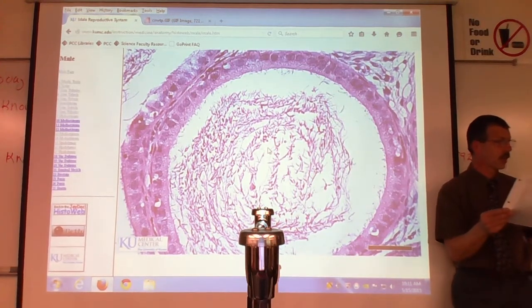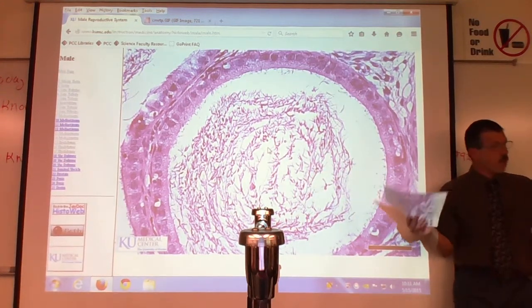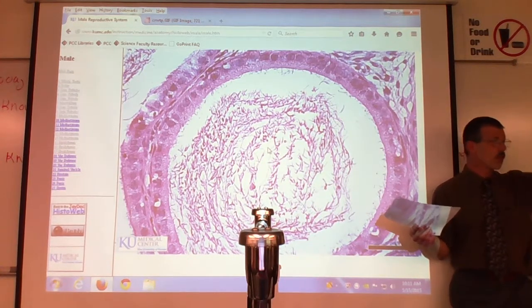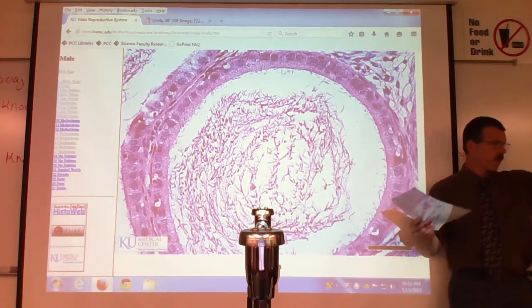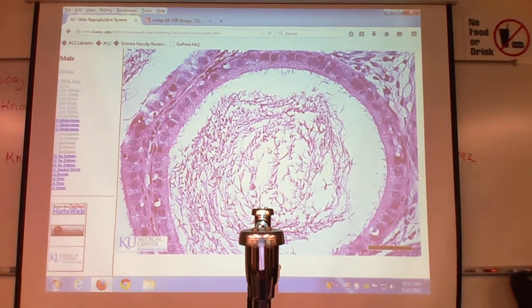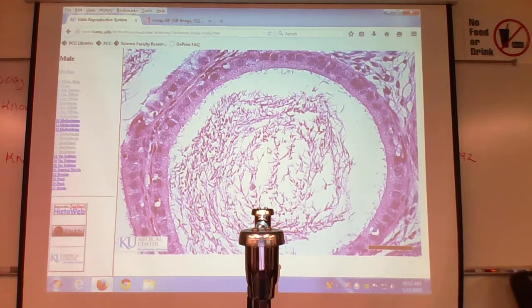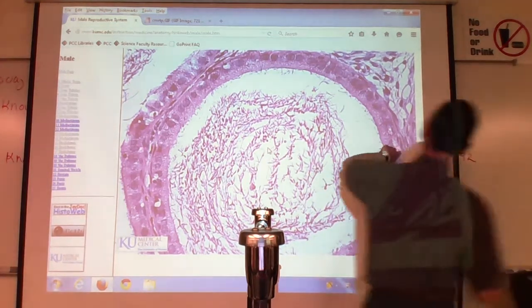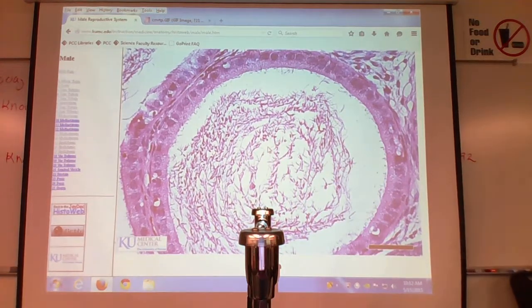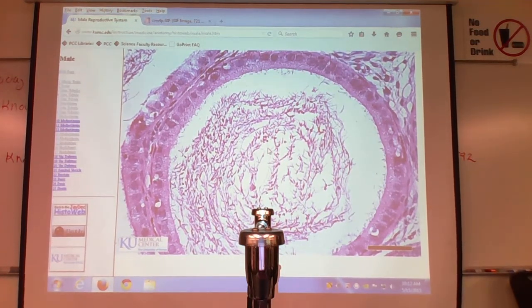What function do the stereocilia have? Basically, they keep forcing the sperm further and further up the epididymis. Normally they wouldn't be moving on their own, so you just kind of kick them down and around. So just keep them moving, keep them circulating. There's an epididymis. So it looks like a standard tubule, but it's not. So is the smooth muscle between the layers of PCC? Yeah, it's basically on the basal lamina.